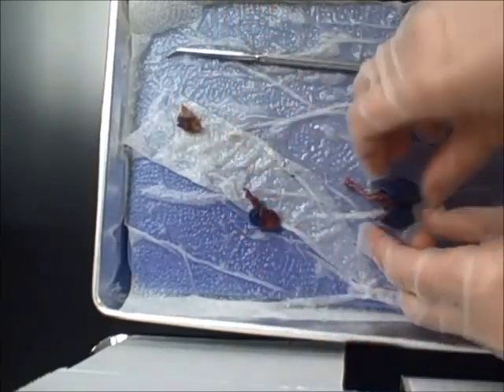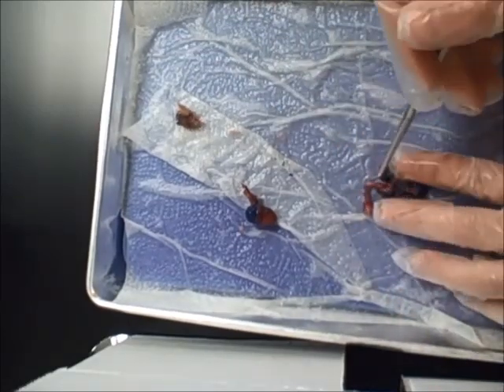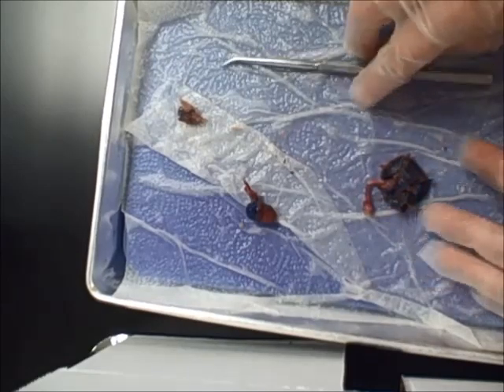Here are the lungs again with the trachea. So you can see how the trachea comes down into the lungs, and then the trachea branches into the bronchi that go to the right and left lungs respectively.